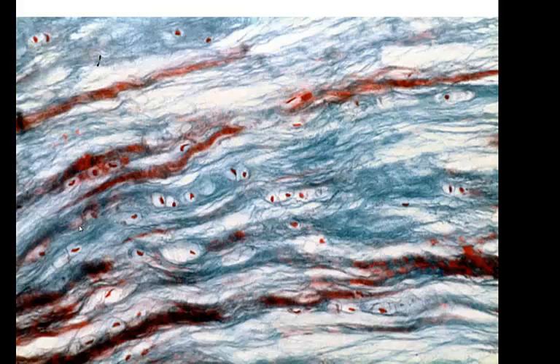shock there. For instance, if you jump off of a house, don't do that, but if you jump off of a house, you're going to take the shock in your vertebrae and in your knees, and hopefully not your pubic symphysis, but those are areas where you're going to take a lot of shock. And so we need more collagen fibers. So here are those collagen fibers like this. All of these strings that you see here are collagen fibers, and because you have so many collagen fibers, it forces your chondrocytes to line up in a row. So if you see collagen fibers lined up in a row, you know you have fibrocartilage.